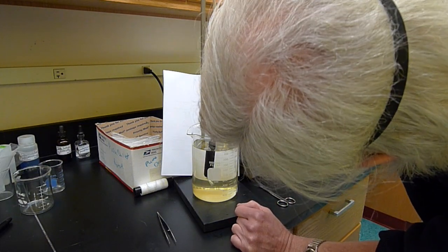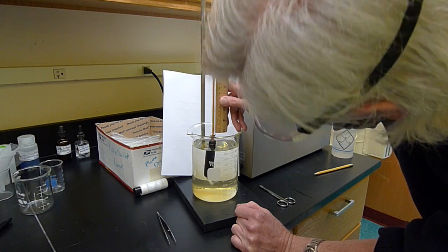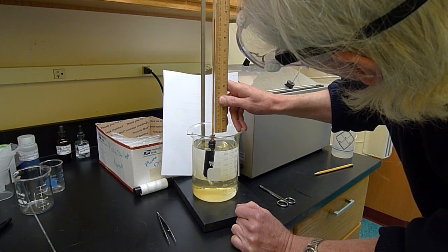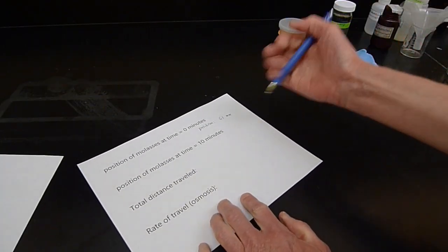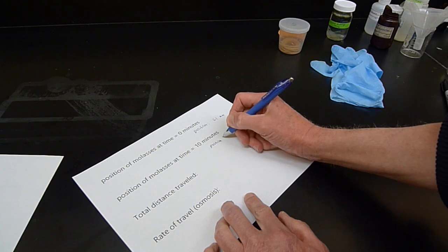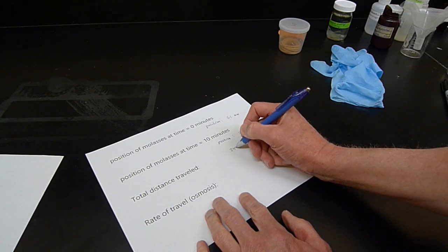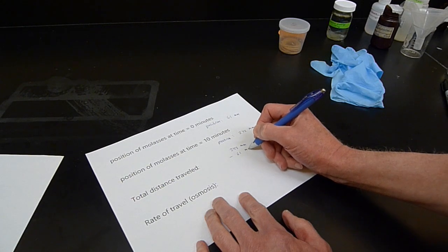On the edge here, some water on the top. I guess I'll take that. I'm going to call it 242 millimeters. So at the end of 10 minutes, the position is 242 millimeters. So 242 millimeters minus the 61 initially.